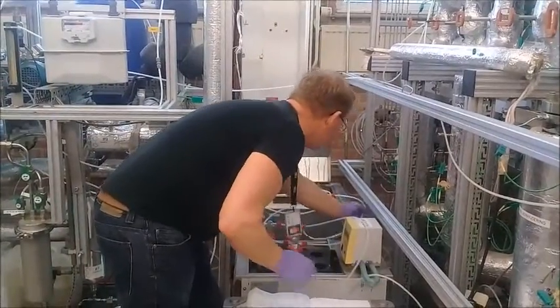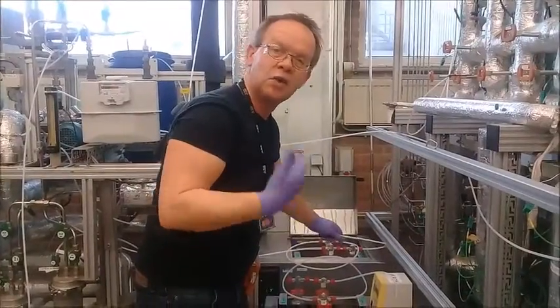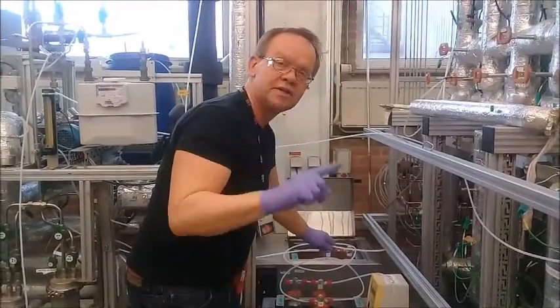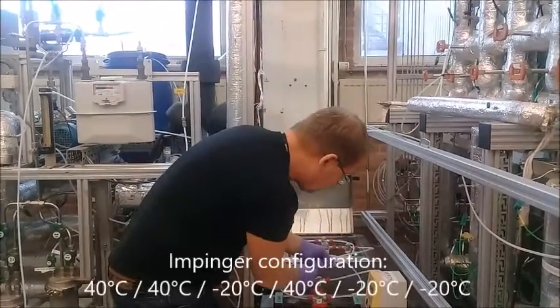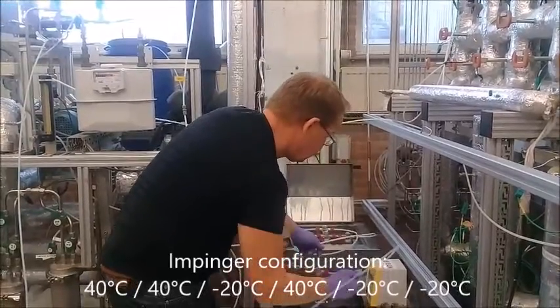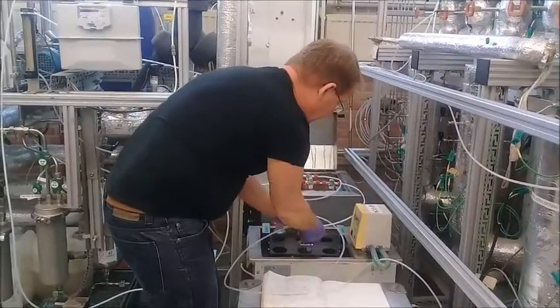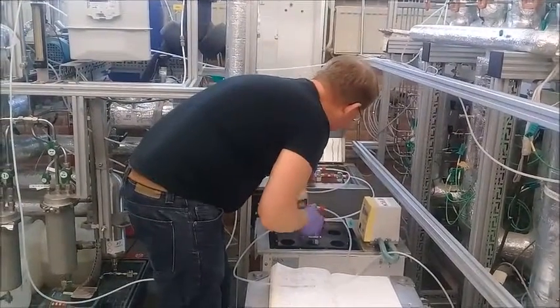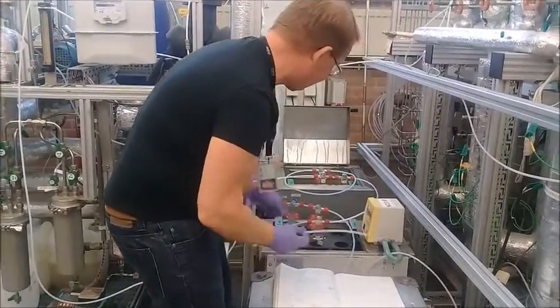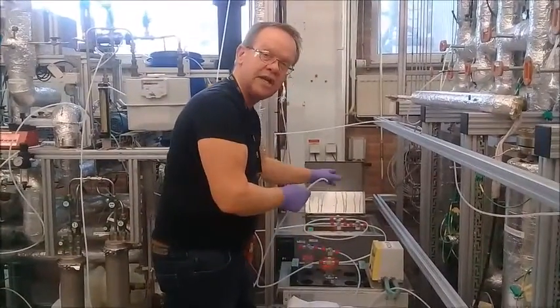So what we do is we have a subsequent heating and cooling section. What we first do is we go from the first 2 washing bottles into the cooling bath on position number 3. So, and it should be nicely connected. I check all the connectors for gas tightness. That's fine. So now we move from the cold side to the heated side.